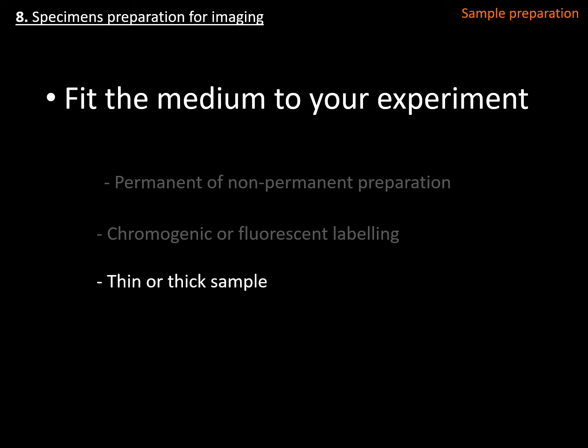And of course, you have to think about if you are using a thin or a thick sample, and the embedded media could actually be your good ally in order to create more transparency or less transparency.